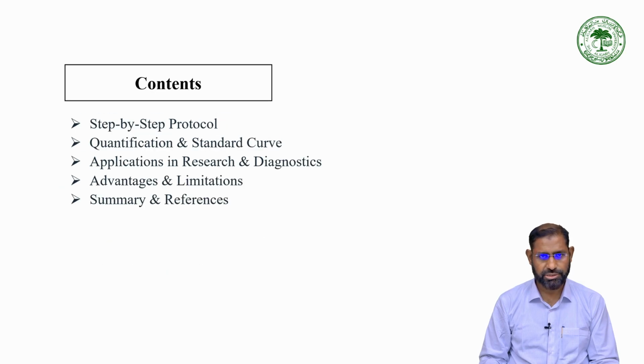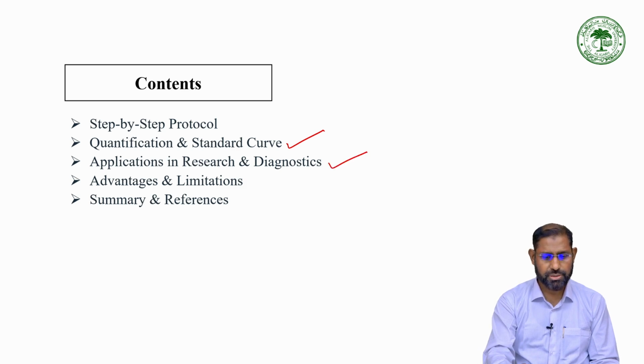Then we discuss a step-by-step protocol, then quantification and a standard curve, and then applications in research and diagnostics. Advantages and limitations, finally summary and references.